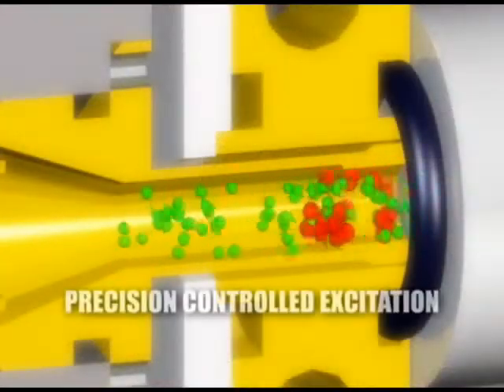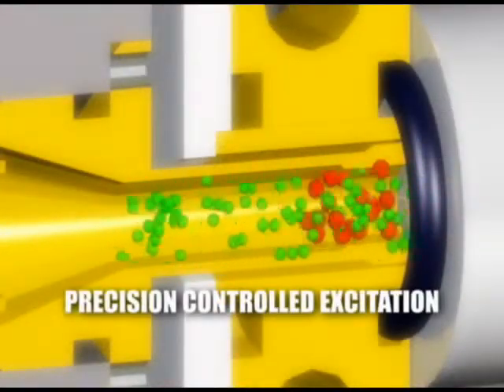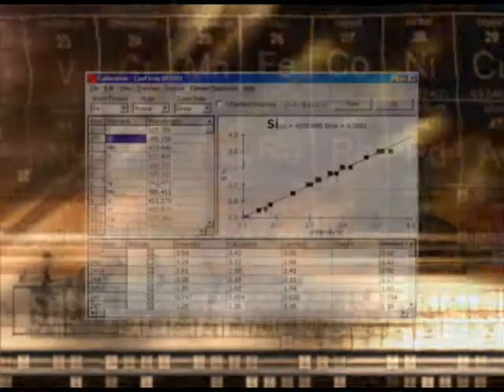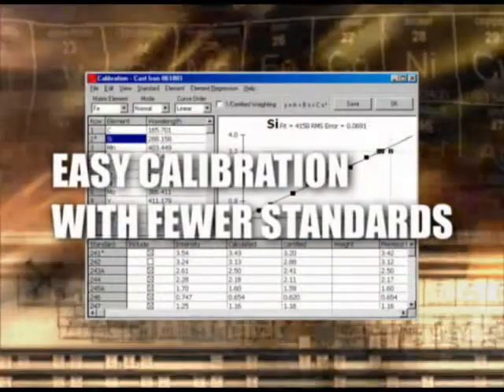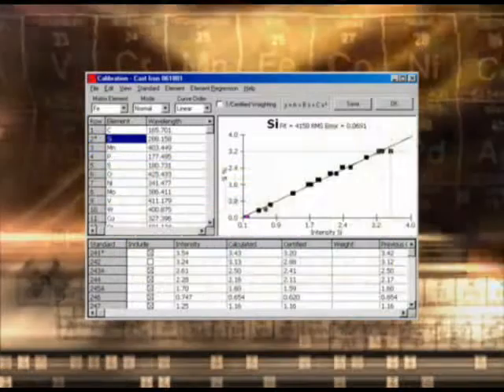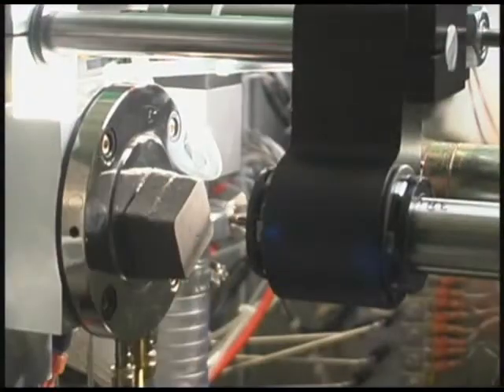The ability to precisely control the excitation enables the GDS500 to obtain the optimum measurement conditions for each method. Calibration of the GDS500 is as simple as selecting the standards for calibration, selecting the elements, and analyzing the calibration samples. Once this is done, the resulting calibration curves can be viewed and certified for use in further sample analysis.